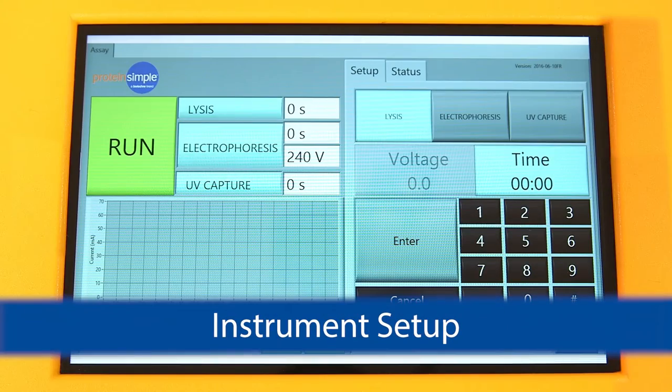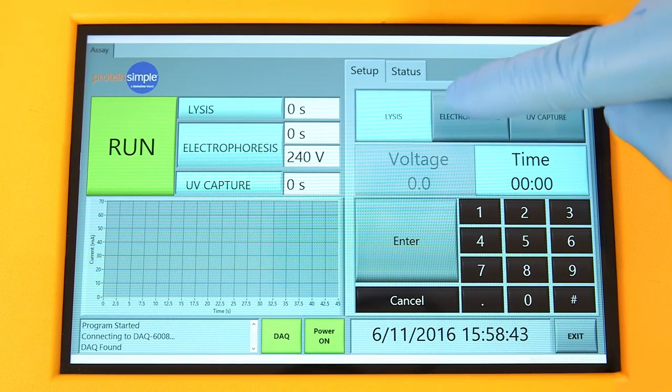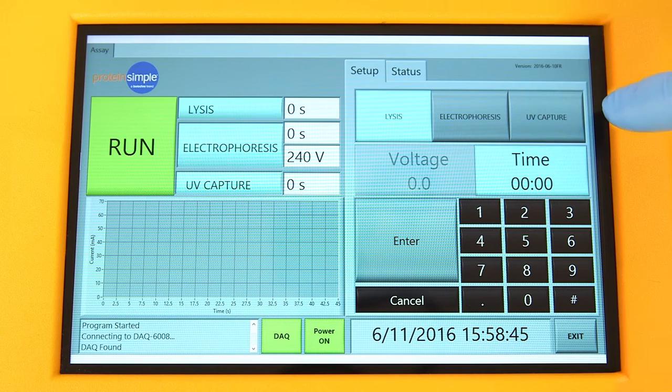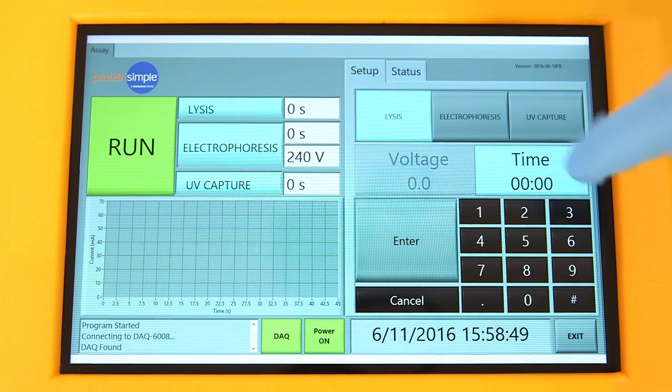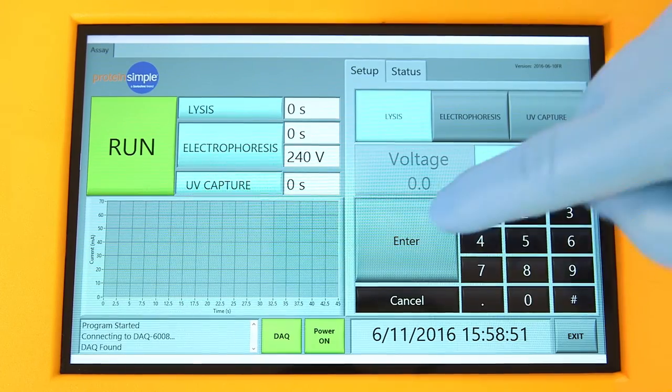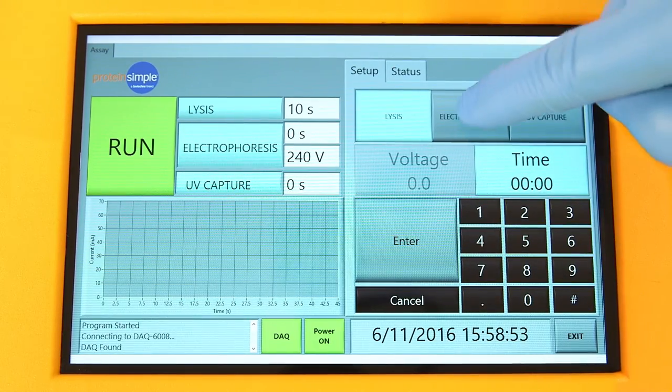There are three parameters that need to be entered before running Milo: lysis time, electrophoresis time, and UV capture time. First, select the parameter that you want to change and then enter the time using the keypad followed by enter.